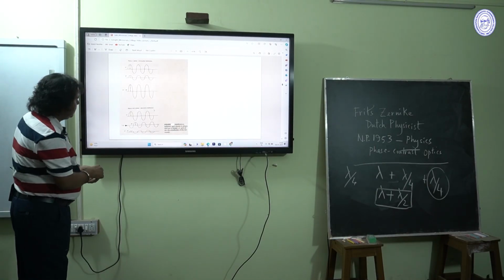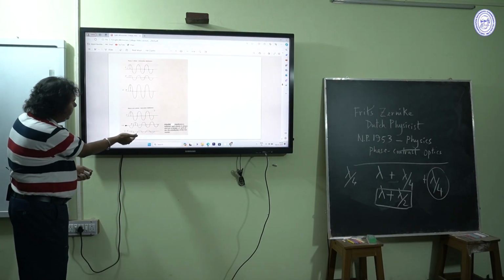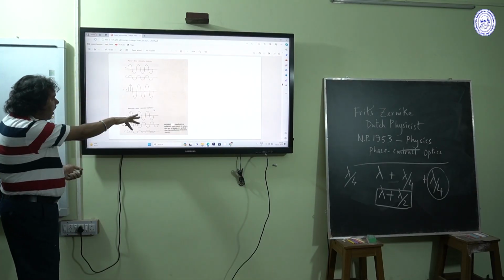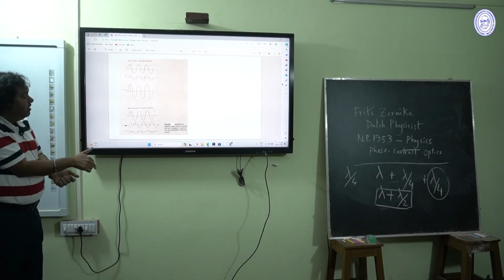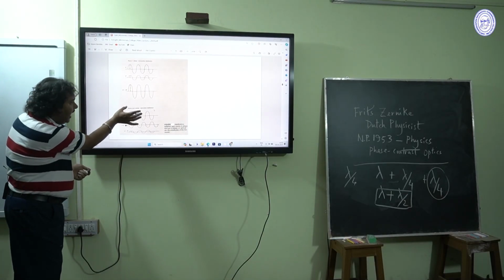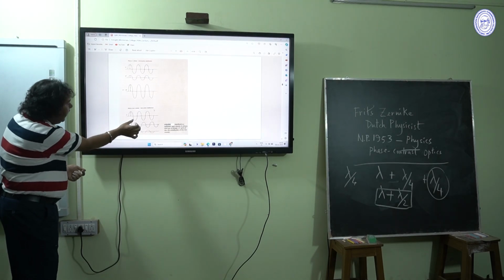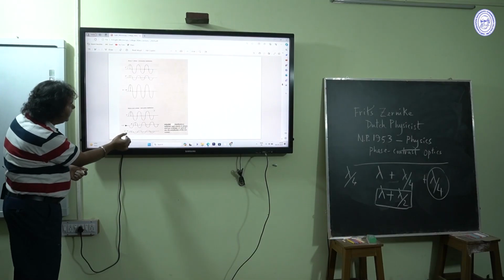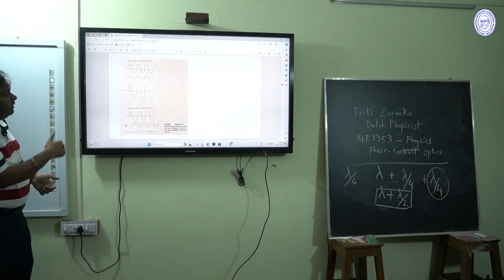And when light waves with different amplitudes have the same wavelength but are not in phase, a destructive wave will be created. That will be A1 minus A2. A1 has the greater amplitude, A2 has the lesser amplitude, but A1 minus A2 will create a much lesser amplitude, so a dull image will be created.